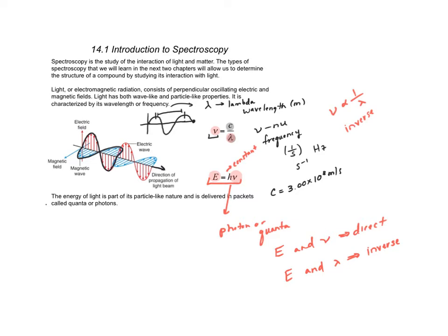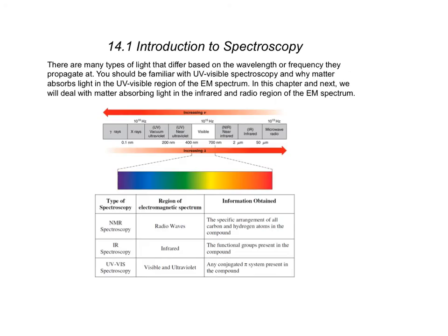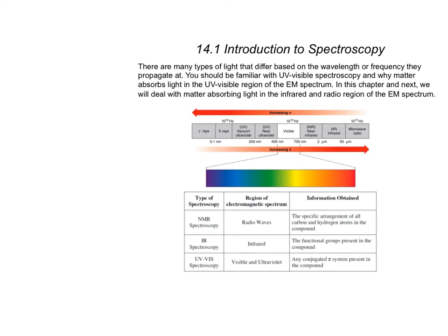This isn't the first time that we've talked about spectroscopy. Ideally in 151 and 152, you were introduced to a basic idea of spectroscopic techniques, and you have probably utilized what is called a spectrophotometer before, at least in 152, I know that you have. If we go back to the idea in 151, 152 of what spectroscopy is, one thing we did was look at UV visible spectroscopy.